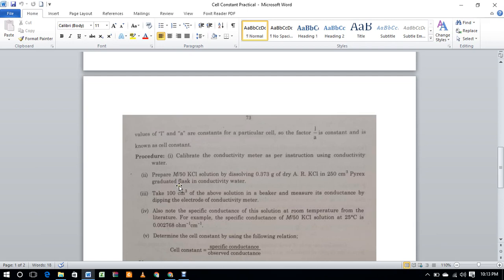0.02 molar. Prepare this by dissolving 0.3737 grams of dry KCl in 250 ml of water.